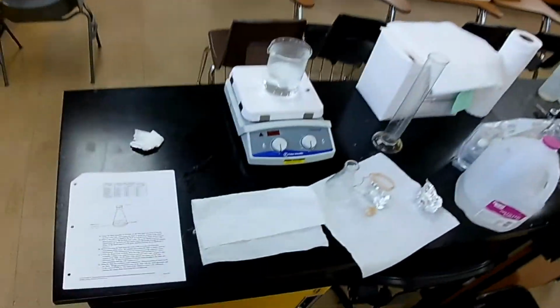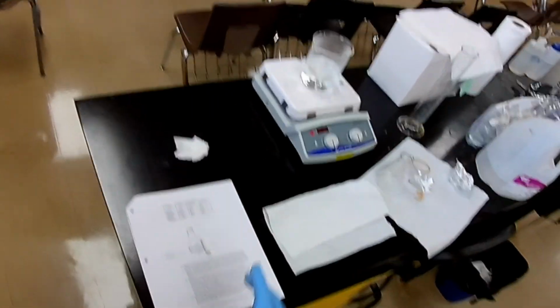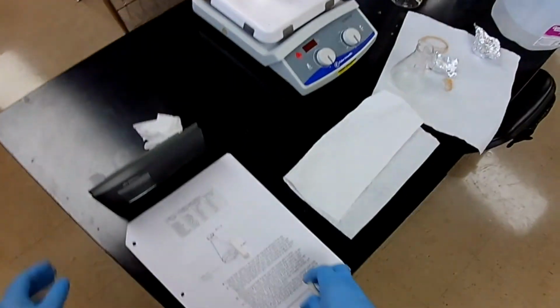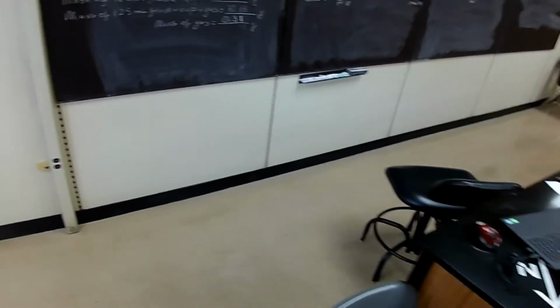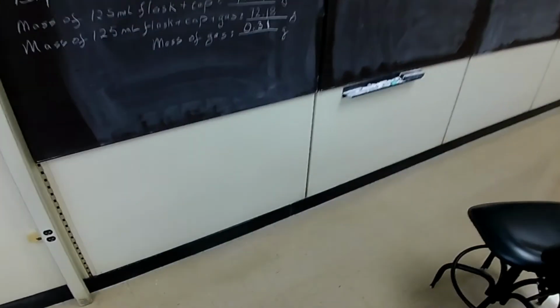Okay, that's it for the Dumas method, and I don't think we were very accurate in our calculations, in our procedure, but those are the breaks. If you identify any places where you saw errors being made, maybe I made errors and didn't notice them, make note of those errors in your report. Okay, that's it, and good luck.